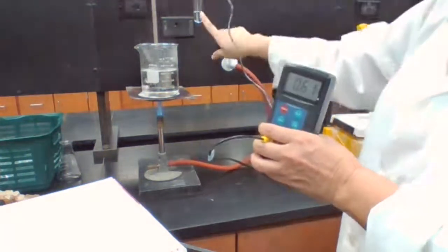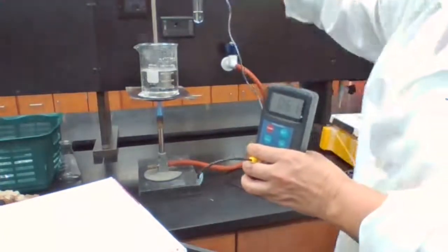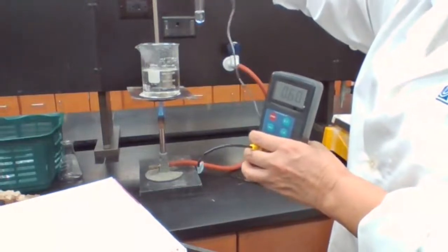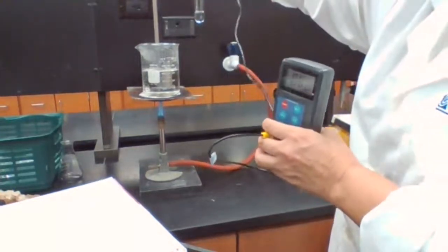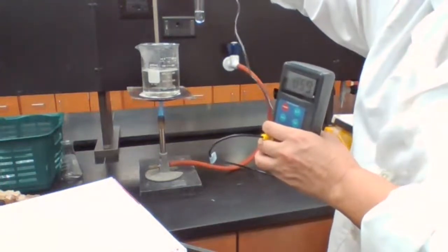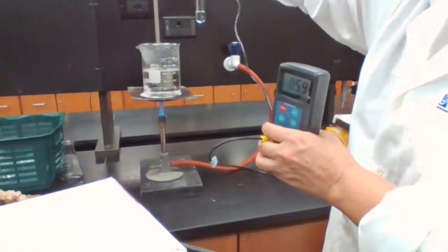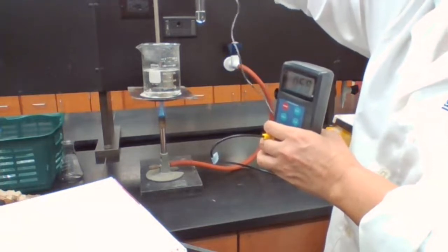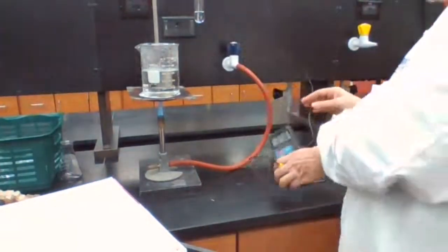So we are looking for the temperature at which benzophenone is going to freeze again. What's important for me is to see the solid, or I cannot move the thermometer probe or the stirring rod, if I'm using the thermometer probe in replacement of the stirring rod. It's 58 and still nothing.